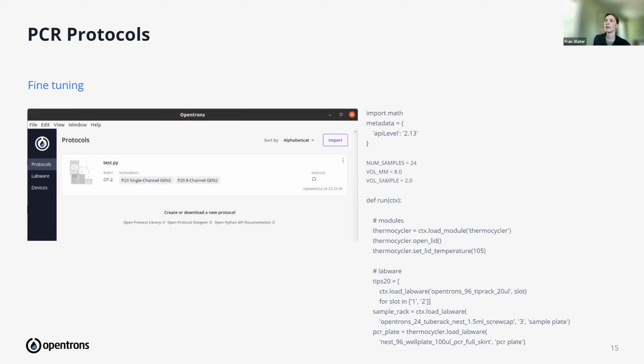Great, thank you. So a question from Hassan. How can I get access to the app that checks the protocols? I've been working on fine-tuning a large language model on protocols, and that would be great for testing. Yeah, I can answer that question. So we do have it available on our website. If you go to our support page, it has a complete guide for you to access the simulator and run it on your command prompt. We can probably provide it for you via email, but you can definitely have that simulator on your computer quite easily.